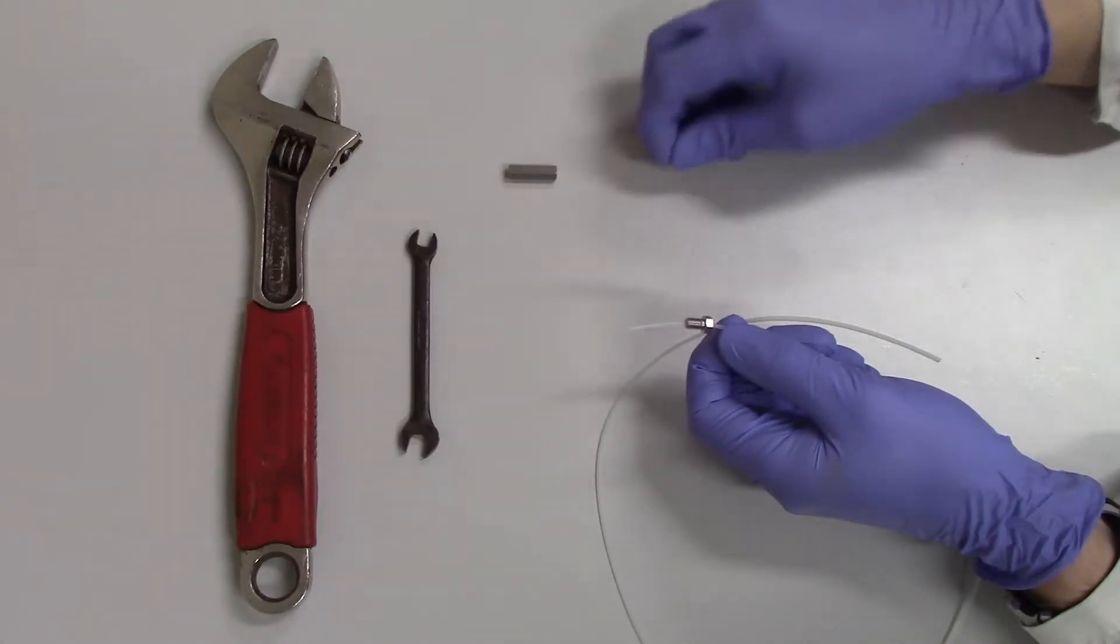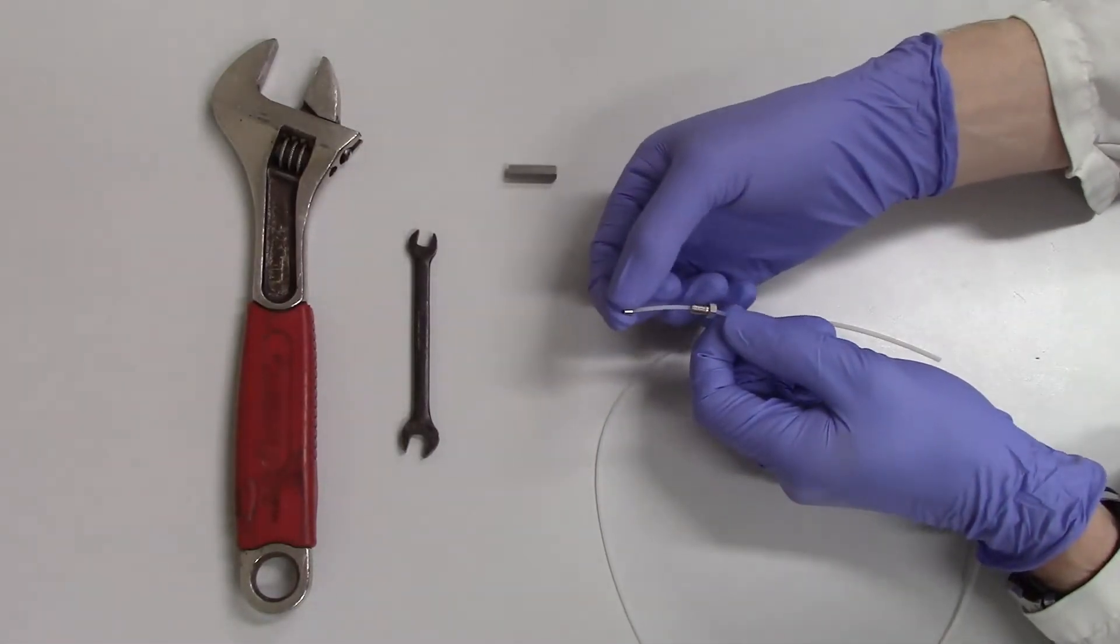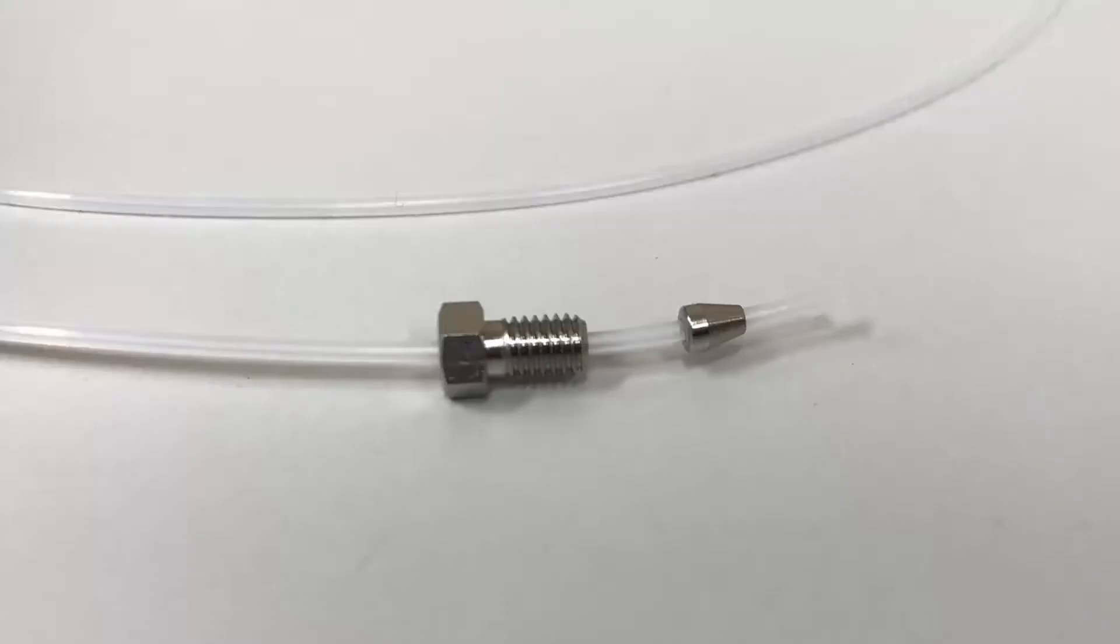Second, place the ferrule on the tubing so that the wide end is closer to the threads of the nut and the narrow side is closer to the end of the tubing.